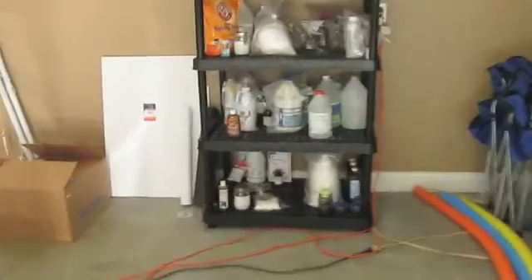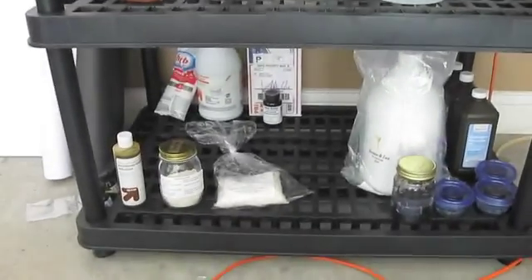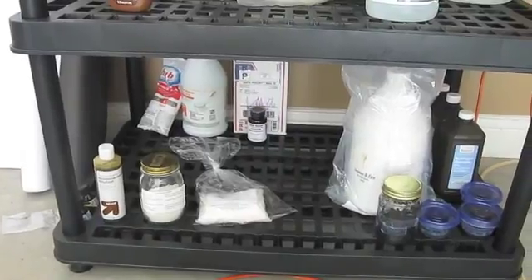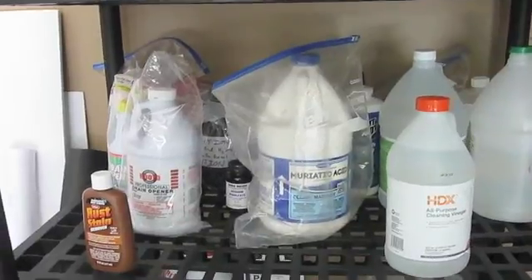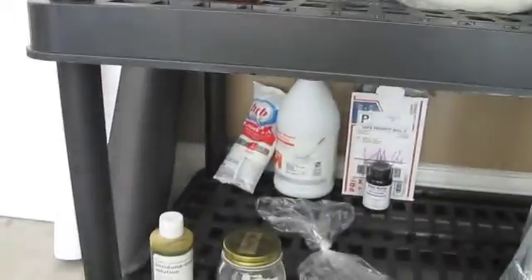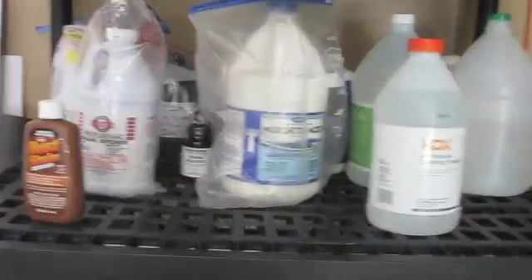On the back shelf I have three more categories. Down at the bottom is oxidizers, and then I have acids. You'll notice that the bleach is way back there and hydrochloric acid is right there.